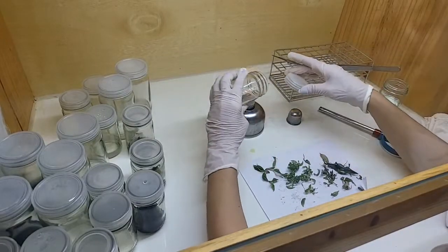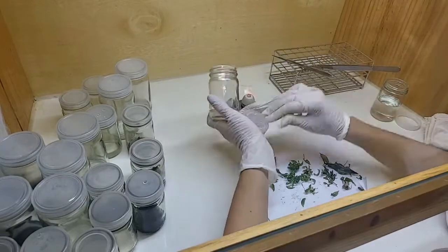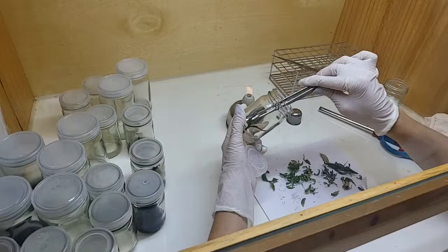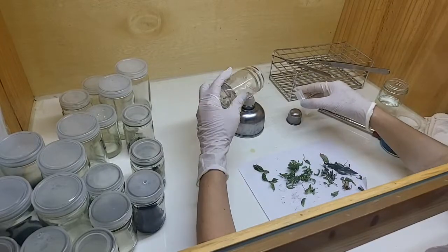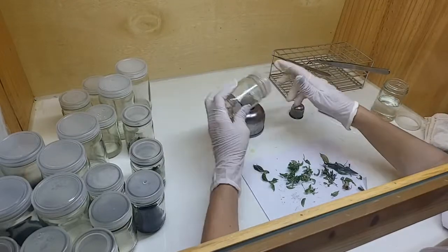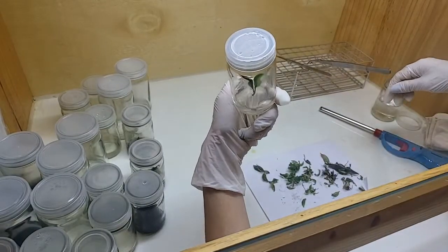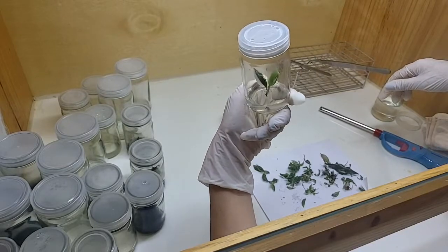We heat up the jar a bit, and the lid at the opening of the jar — that's where bacteria could be. Because even though the jar is closed with a lid, it's a precaution. We have to be extra sure, because even with all the burnings, sometimes things still get contaminated.